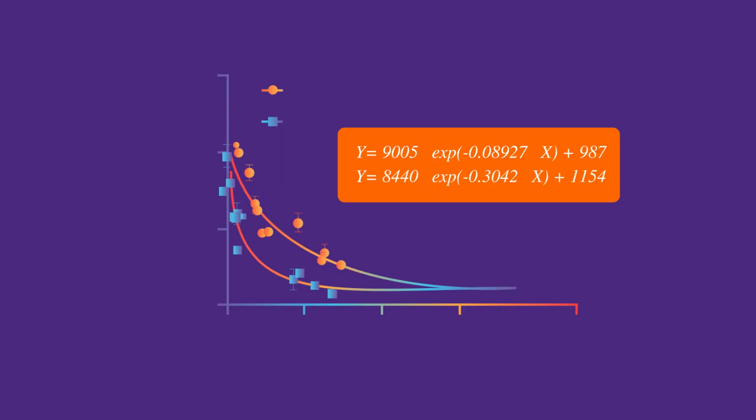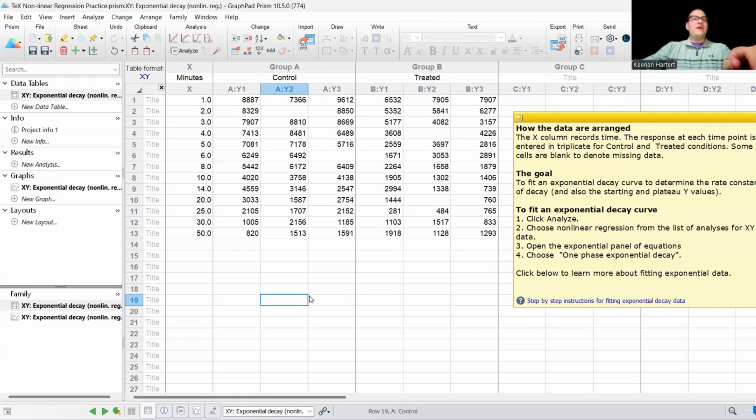Like most of you, I like inserting a lot of my text and guides in a single figure so that people don't always have to dig through the caption. So let's go ahead and start. If you want to get into Prism's tutorial data, you would load up an XY and say nonlinear regression.